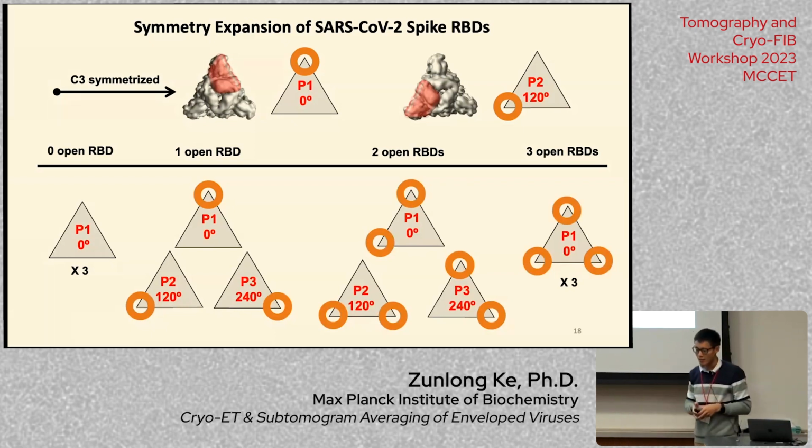So the idea is that you will be focusing on only one position, let's say here, right? At each time you just focus on this one, and this one here as well, and here as well. This will be absent, this will be present, right? So this one is present, absent, absent, present, present. So you just do it this way, so you figure out which particle has 1 or 2 or 3 or 0 opening positions.